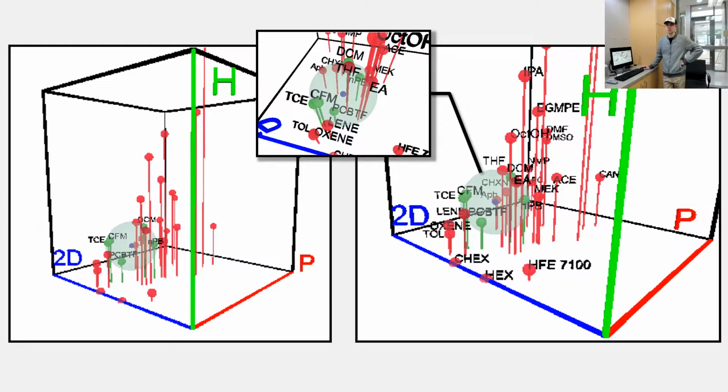I see. So we thought it was the spectrum of glass, but it might be the glass particles in the grease that were giving us the Raman. That's more on the Raman later. Teaser.